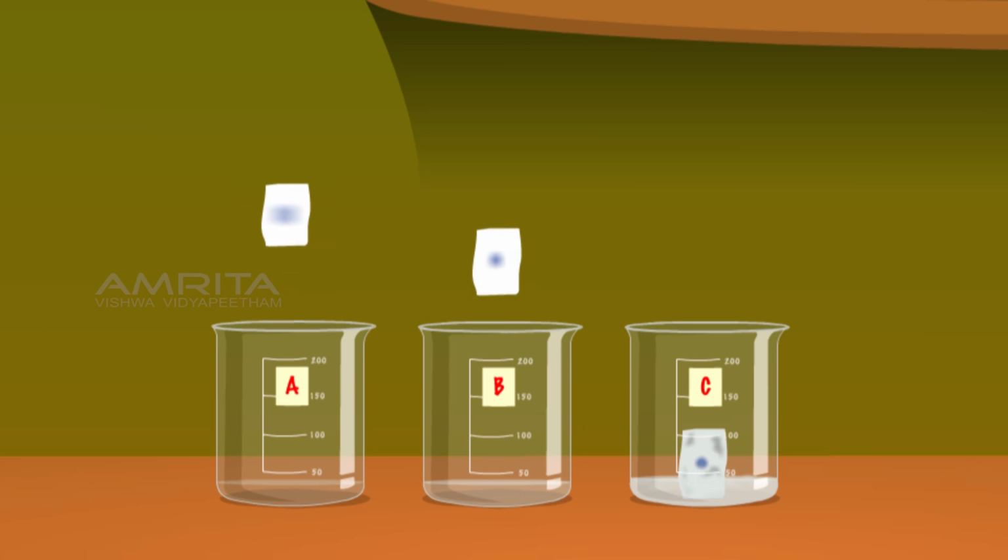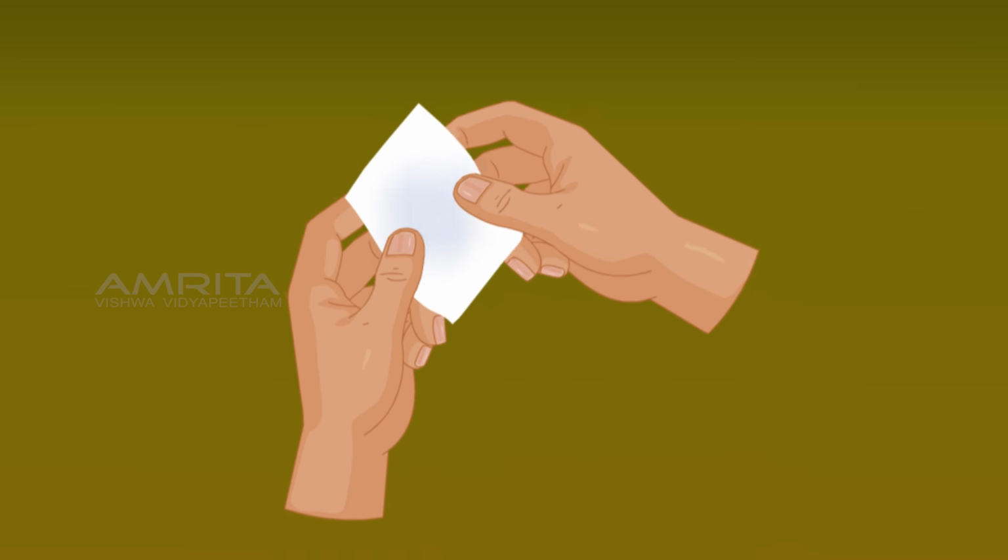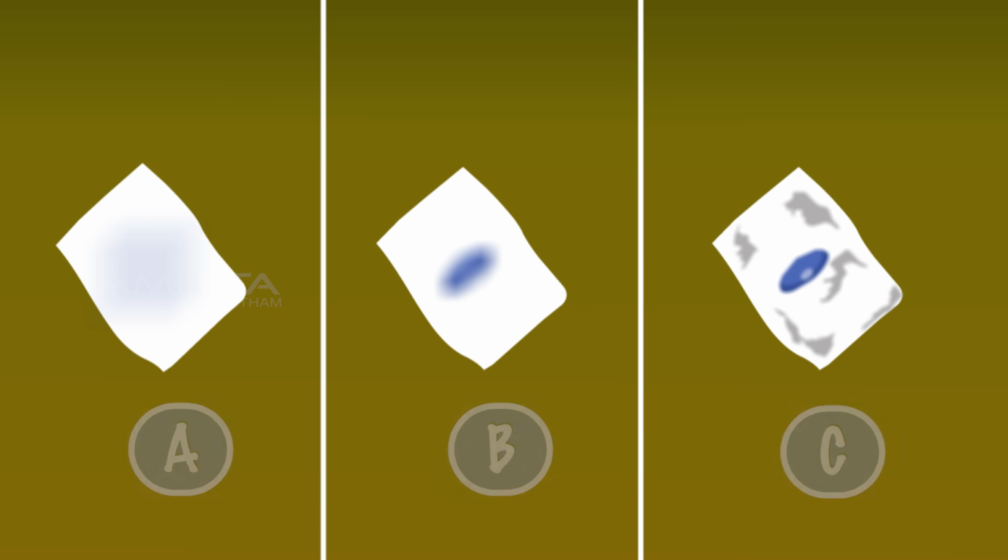Remove the pieces of cloth from the beakers and rub each piece. The ink spot on cloth in soap solution A has almost disappeared. The ink spot on the cloth in soap solution B has partially disappeared. There is no change in the color of the ink spot on the piece of cloth dipped in soap solution C, and some scum has been deposited on the surface of the cloth piece.